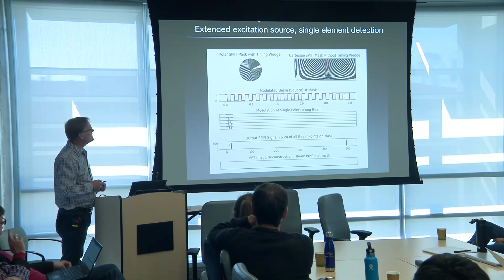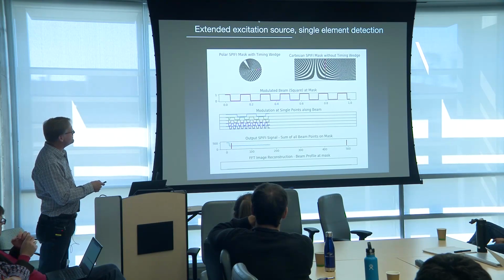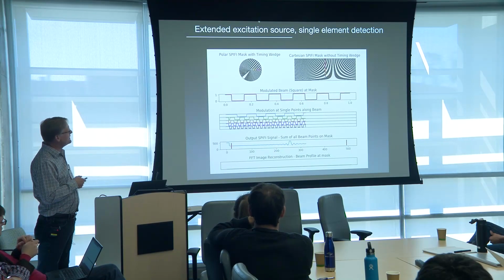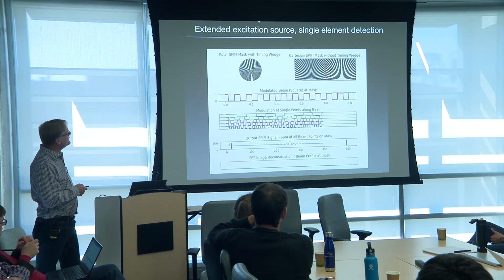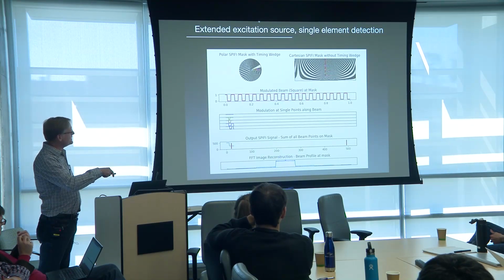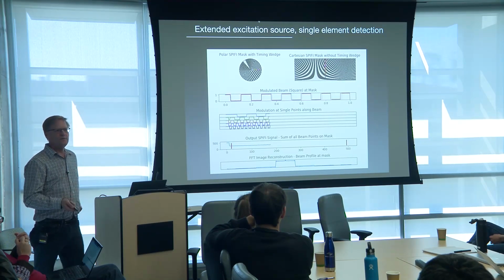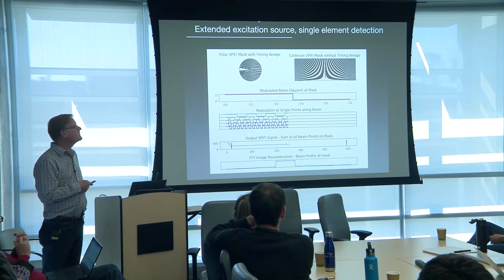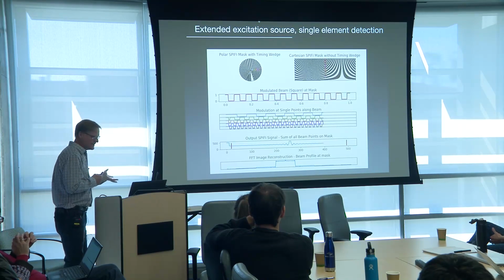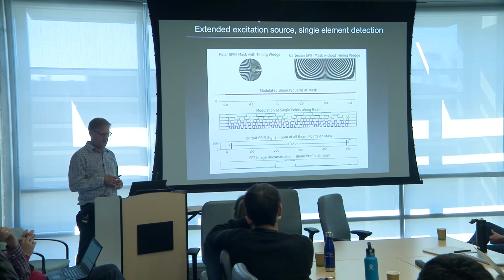So again, just to build up your intuition. Each of the pixels is blinking on and off at different rates, and they all sum up to produce this spatial frequency projection. And we're going back. There's our time signal. And we're almost all the way through. And there it is. Then take the Fourier transform, and there's our reproduced system. So we're getting our one-dimensional images out of point detection. And so we really don't have to worry too much if our light's scattering, we've got an extended source, so it overcomes one of the limitations of our original system.